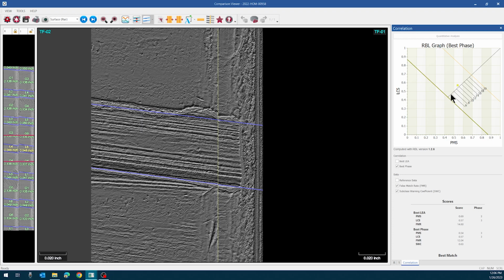And the closer that marker is to that separation line, well, that area is pretty much where the visual comparison starts to become quite apparent to the human eye. You can have matches that are below that. You can have non-matches that are above that separation line. But ultimately, you'll see similarities as you get close to that area. And then the further up it extends, the stronger those similarities should be, like we were seeing on our comparison right in the middle of the screen here.